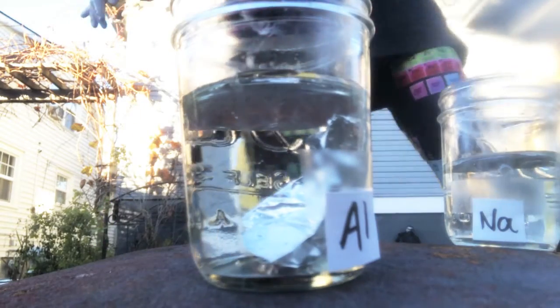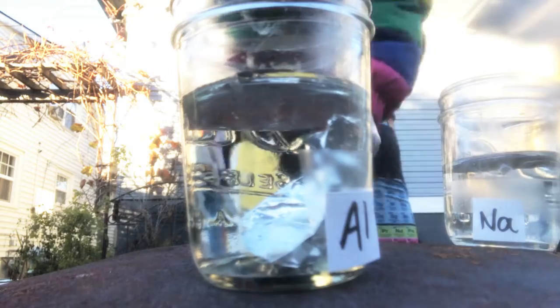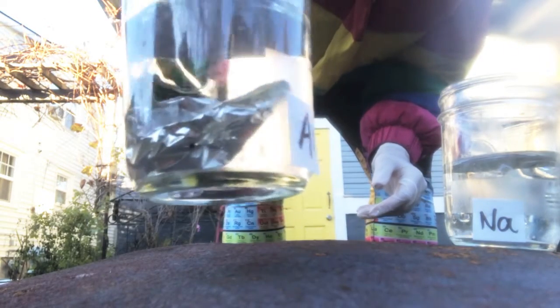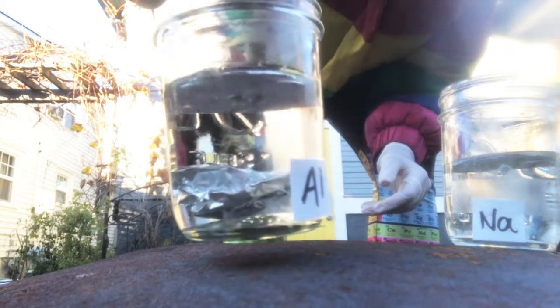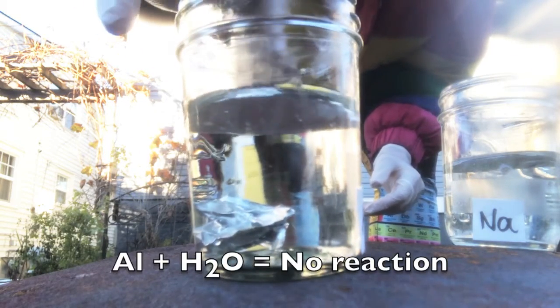So, is anything happening? Nothing's happening. It's not bubbling. It is a metal. Lithium is a metal. Aluminum is a metal. Nothing's happening. No bubbling, nothing.